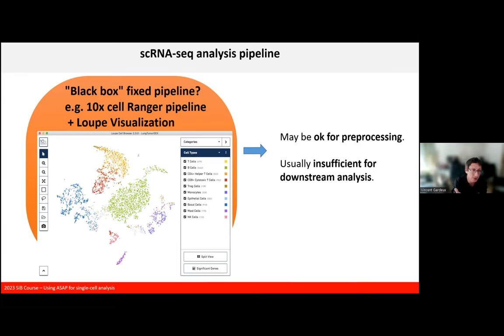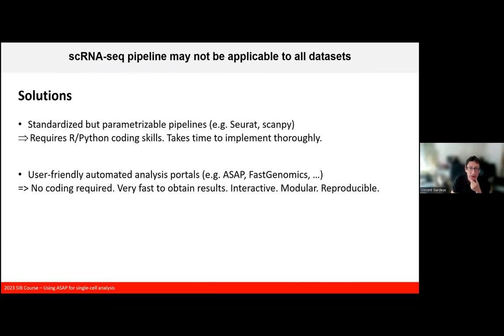So it is possible, for example, in CellRanger to do an automated downstream analysis pipeline, and then you can visualize it using the Loupe tool that is present for 10x. But it's limited, of course, because then you cannot reprocess anything. So everything is fixed, and then you need to work with what is generated. So that's why there are some other tools that exist, and I don't think that many people are actually using this Loupe visualization thing.